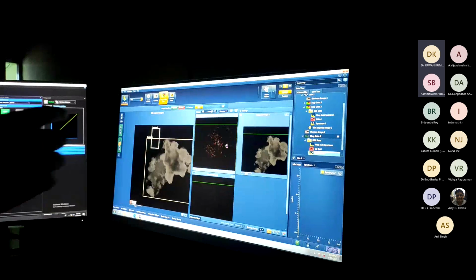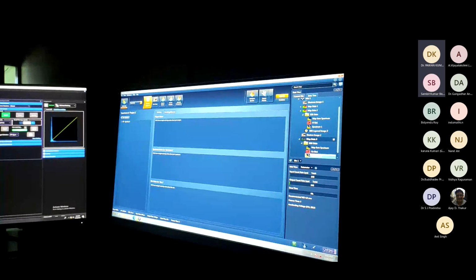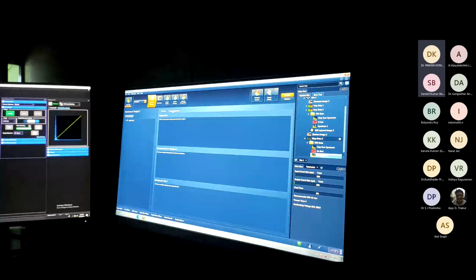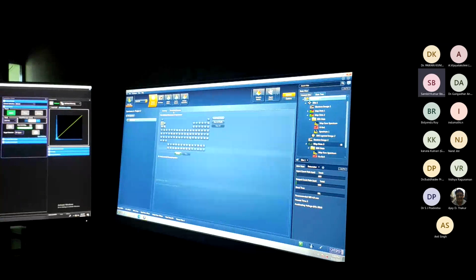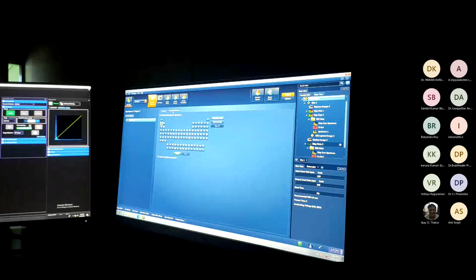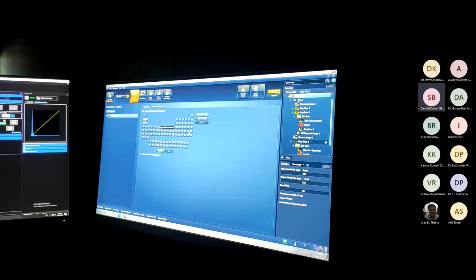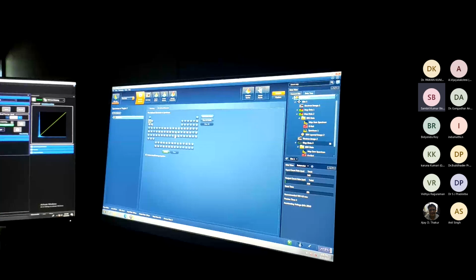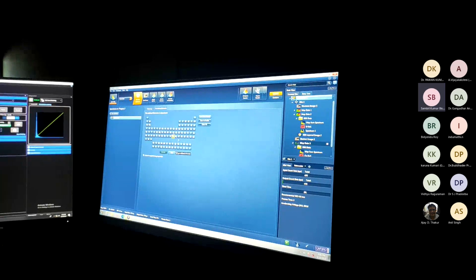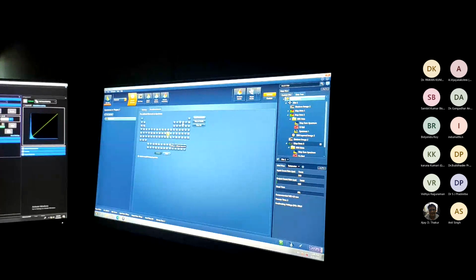Now coming to the point and ID. Predefined element. So I'm defining what possible elements are present. One is the AU. Where is the AU? So I'm including it. And AG, including AG and oxygen.